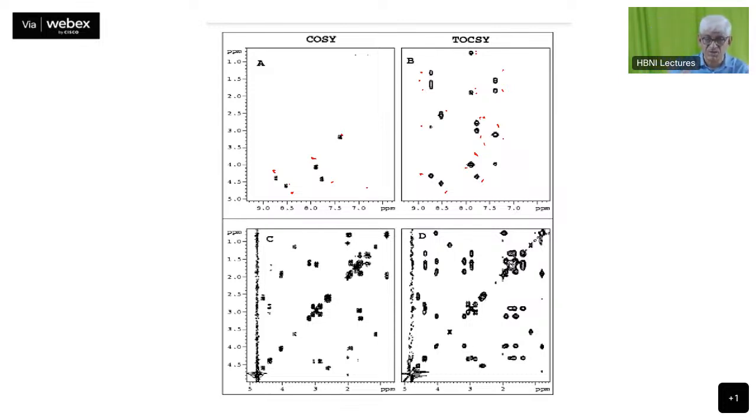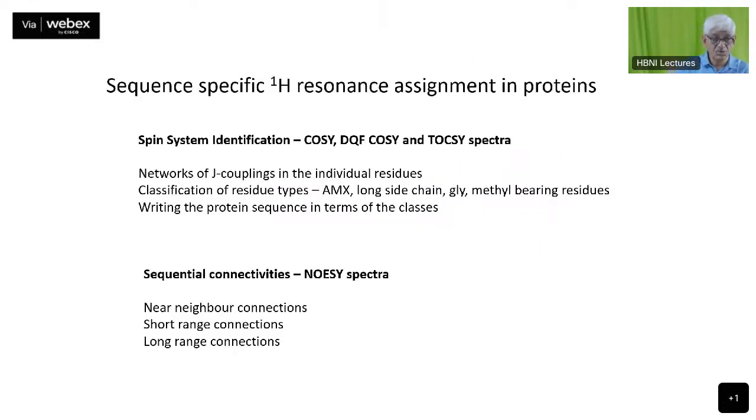Identify the chemical shifts of the individual amino acids. And this is the expansion of the same area in a little bit more detail. And this shows the further expansion of the alpha beta area. So there are further expansions of these ones. Among the betas and among gammas, what sort of combinations can be present in this area. Okay, so this is the kind of characteristics you will see in your spectra.